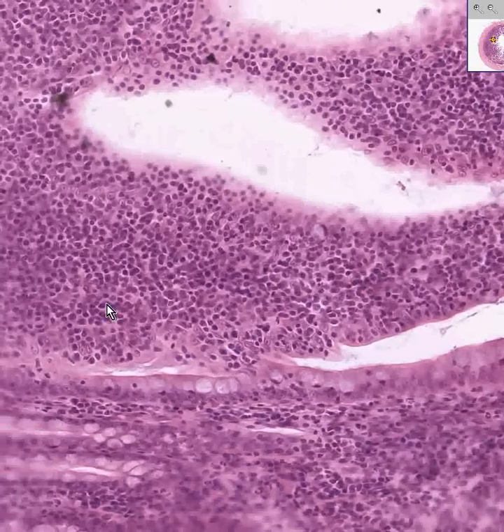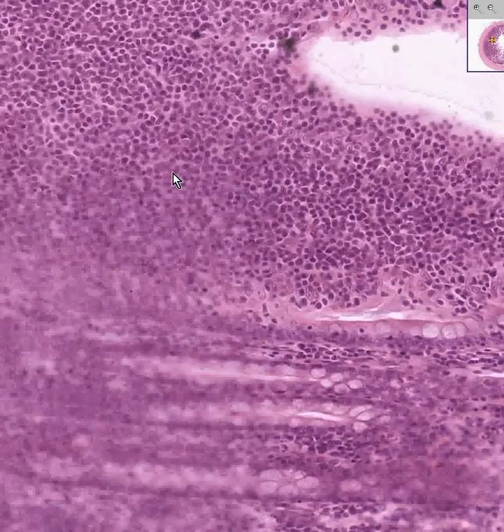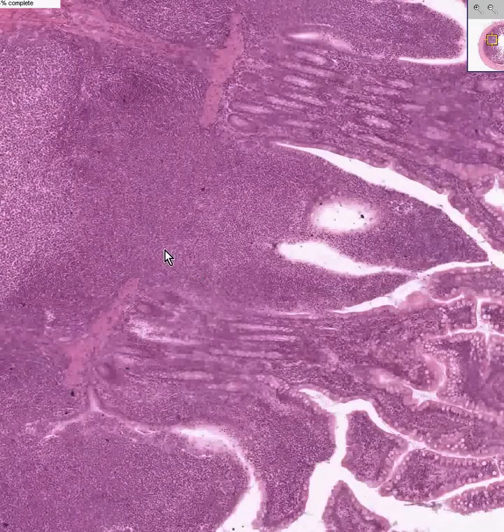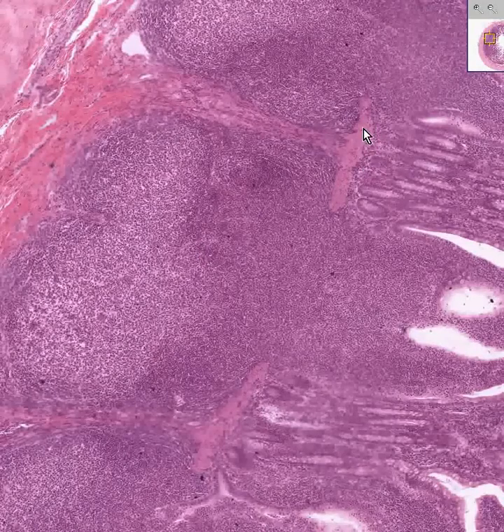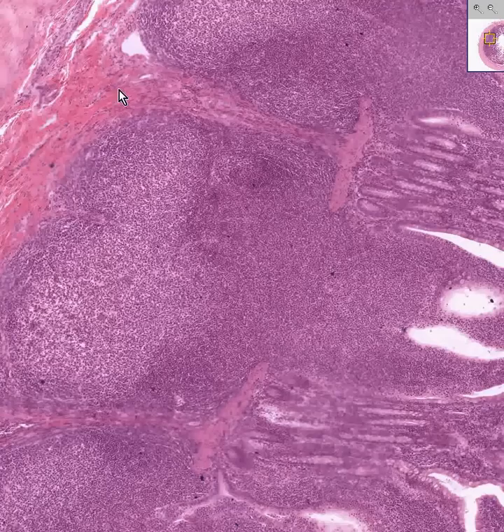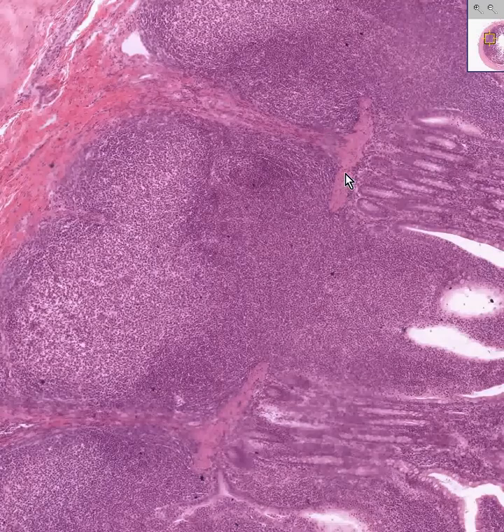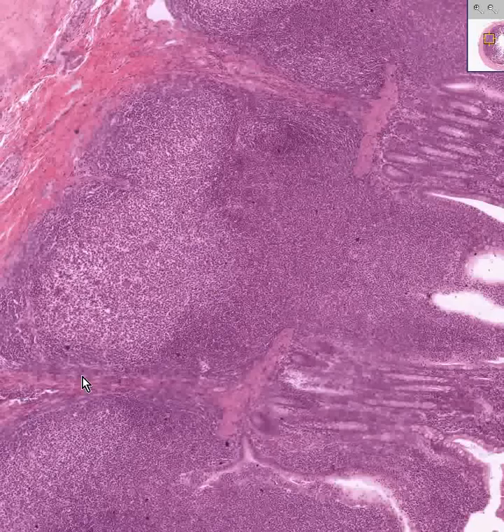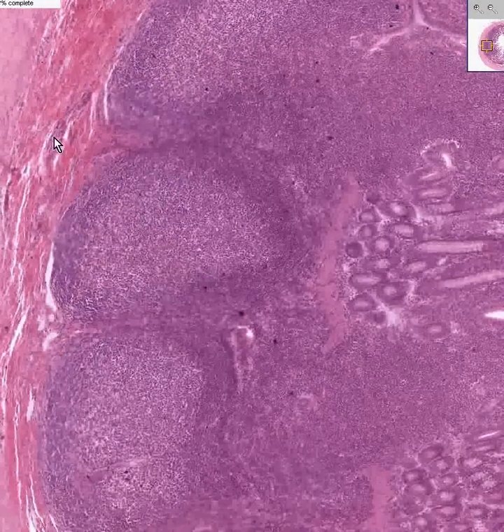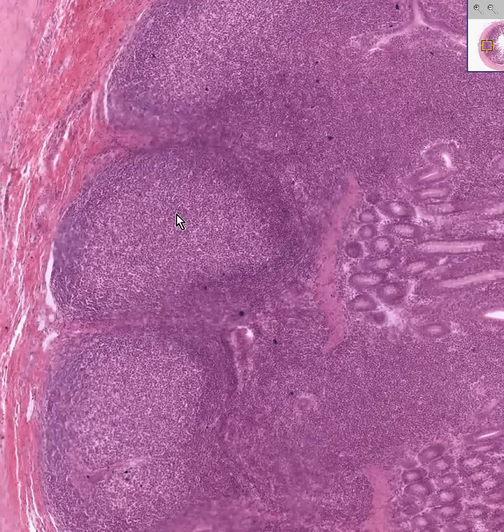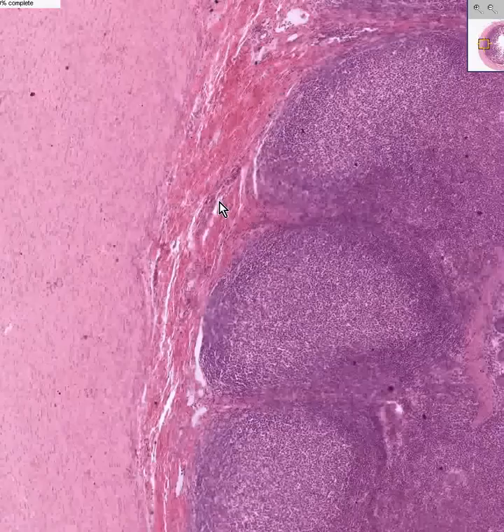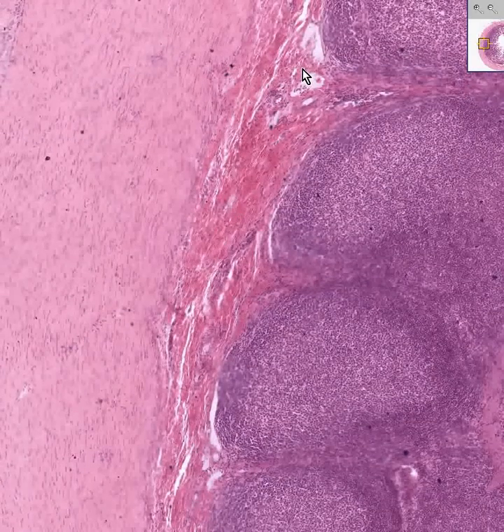We are now very close to the end of the mucosa, and that's why we're starting to see some lymphoid patches in the submucosa, which are very abundant. What you see here is probably a remnant of muscularis mucosae, or perhaps a dip of submucosal connective tissue — I suspect it's fibrous connective tissue. Here is the connective tissue of the submucosa and a secondary lymphoid nodule or lymphoid follicle. Notice these extend into the mucosa as well. Here are some blood vessels and lymphatics.